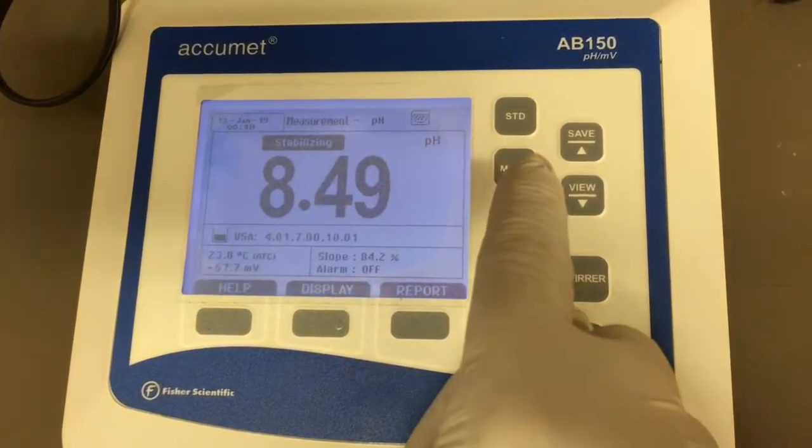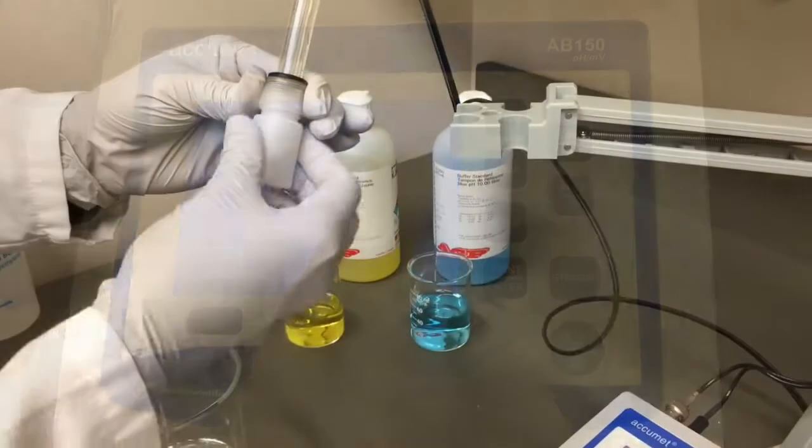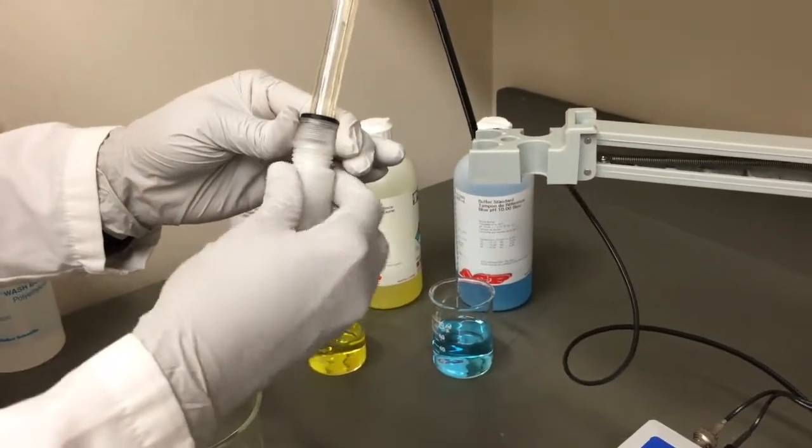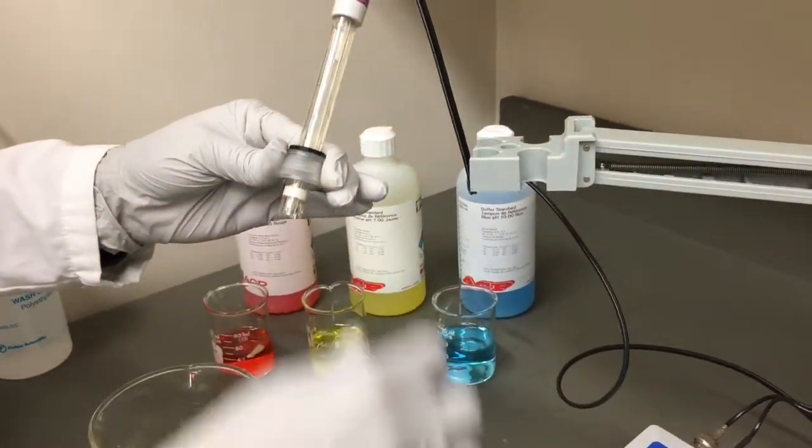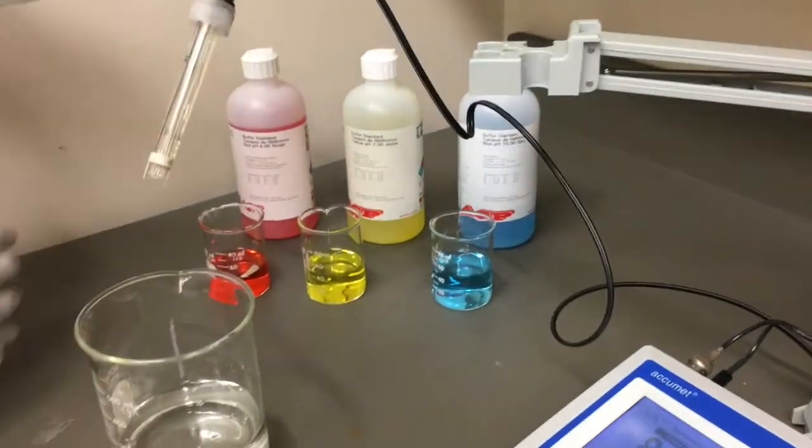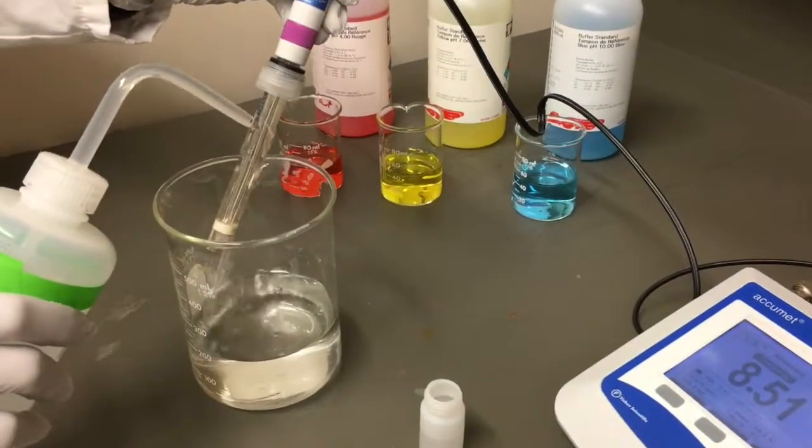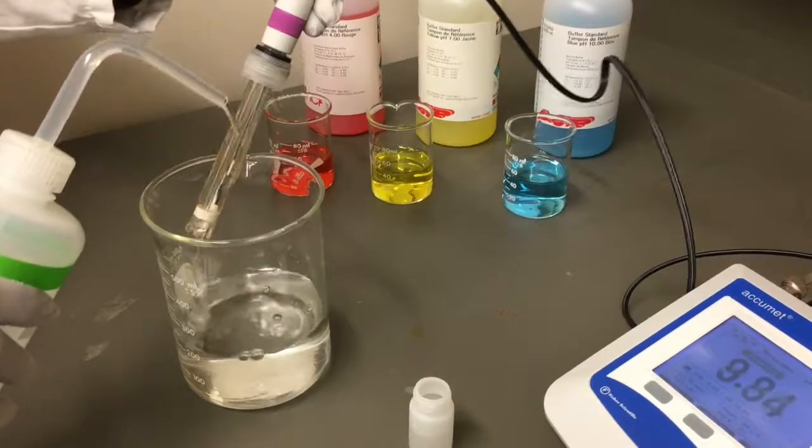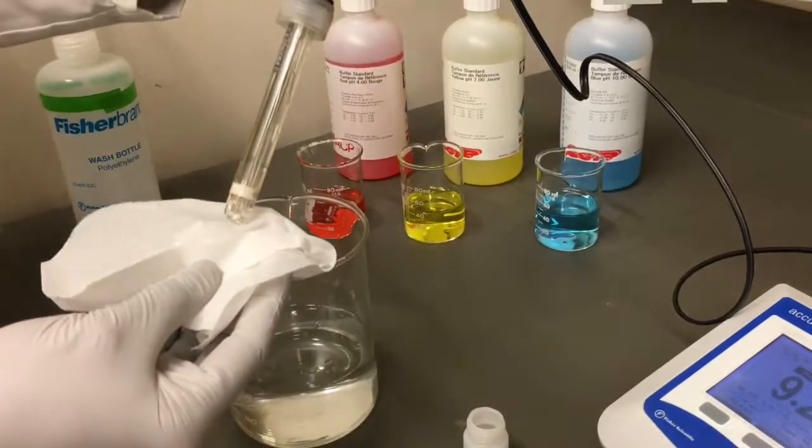Confirm the mode is set to read pH. Remove the storage container from the probe and carefully move the lid portion to the upper region of the probe so it does not contact your solution. Rinse well with clean distilled water and remove excess water by gently touching the tip with a kim wipe. Do not wipe the probe as this can cause damage.